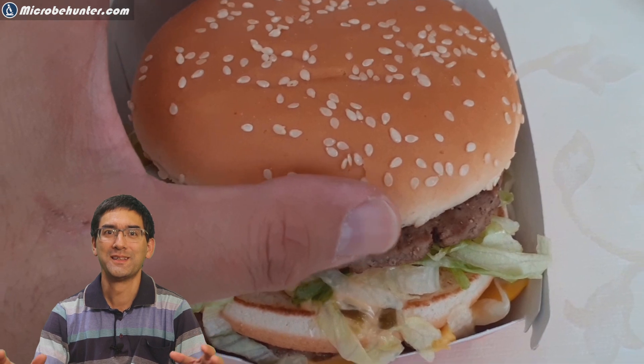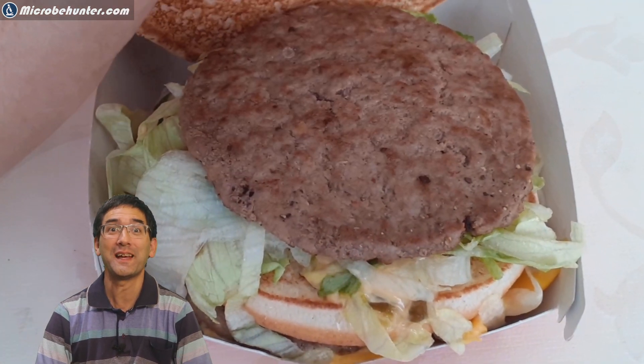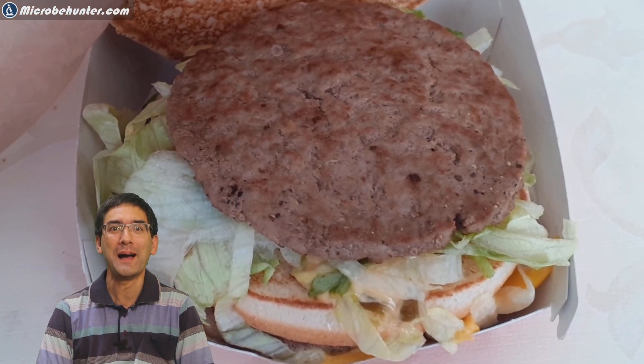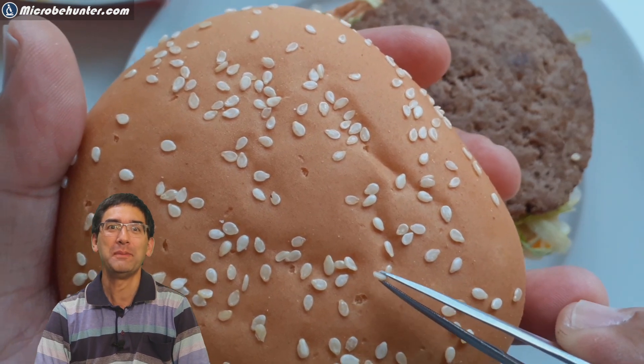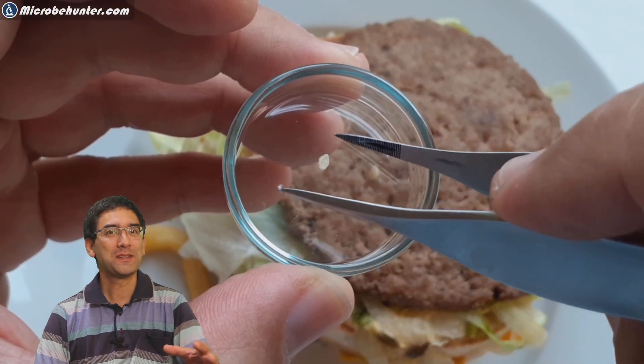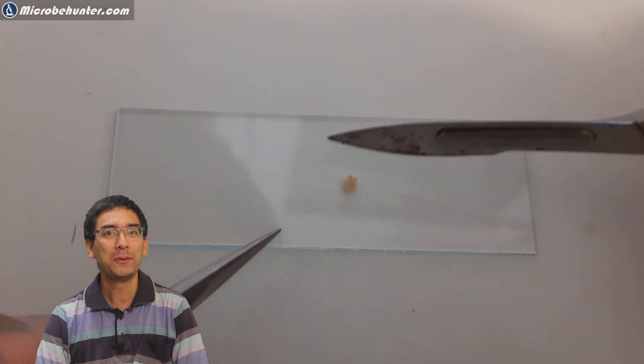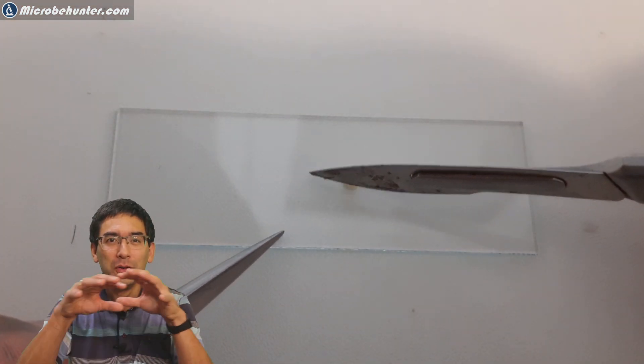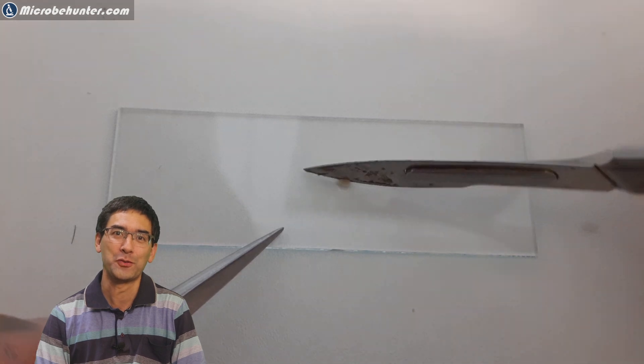Look at this, it's a little bit like Christmas. I think it's my first Big Mac ever - I don't remember having eaten any Big Macs before. Let's start right away. I want to put the sesame that is on the bun under the microscope first.